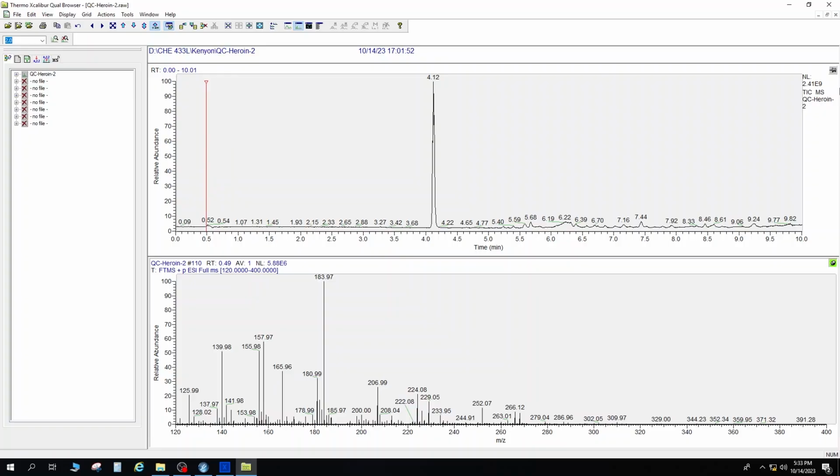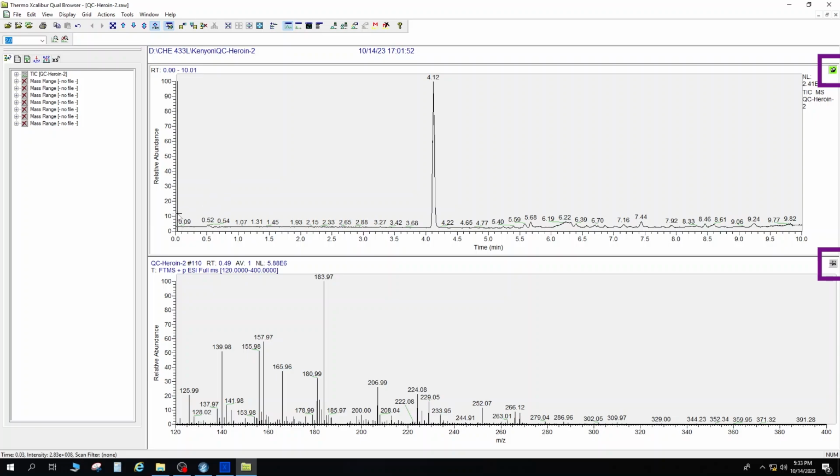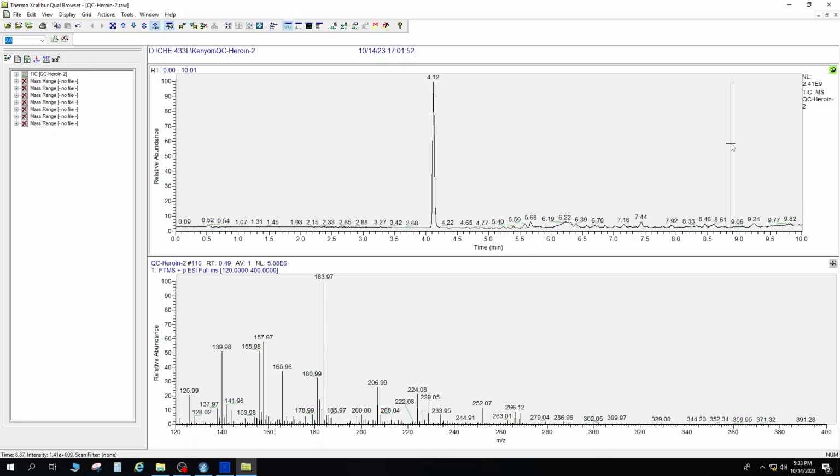We can actually change this and click on the thumbtack for the chromatogram, meaning that we're highlighting the chromatogram. The reason you would want to do that is that it lets you zoom in and out on the chromatogram view. But if you're clicking around and the software is not doing what you would expect, usually the first thing you want to check is, do you have the right thing thumbtacked? Unless you are zooming in and out in the chromatogram, you generally want the mass spectrum thumbtack clicked down so it is showing up in green.